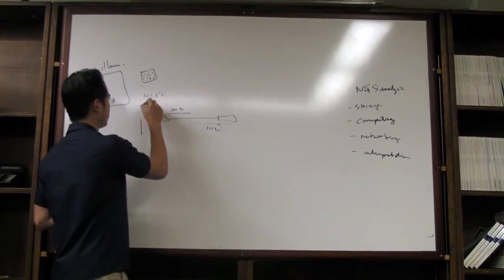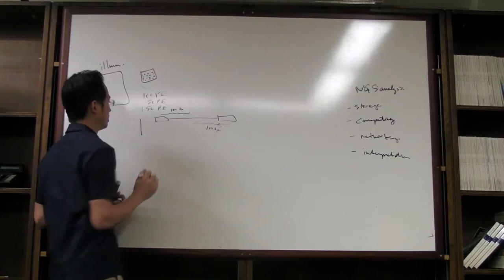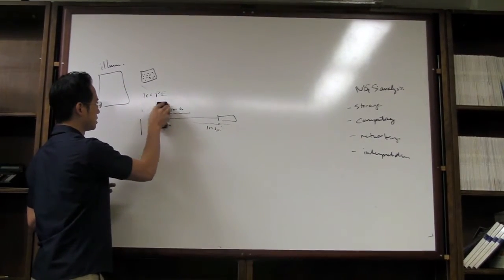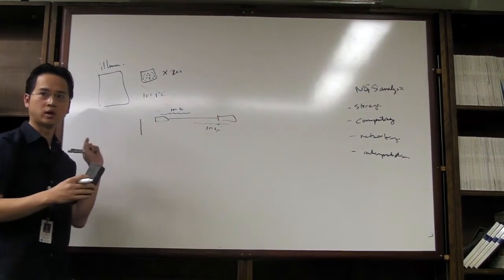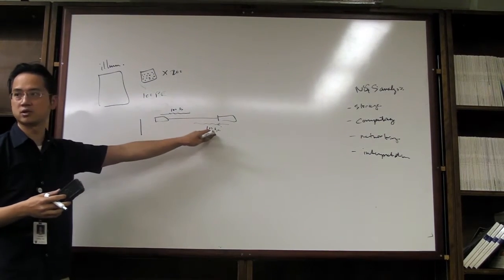Some other folks do 50 base paired-end. Nowadays with MiSeq you can do 150 bases paired-end. There are different reasons for doing paired-end, but let's just say you do a paired-end run. So this would have undergone 200 cycles of sequencing: 100 in one direction, 100 in the other direction. So it's like doing a forward and reverse sequencing.